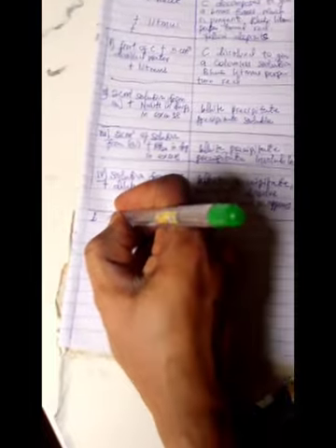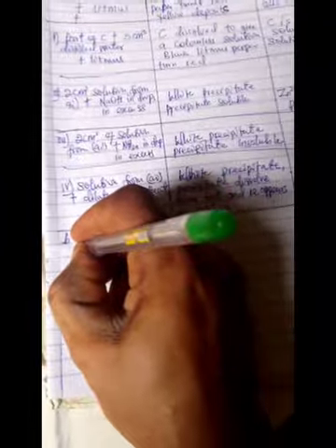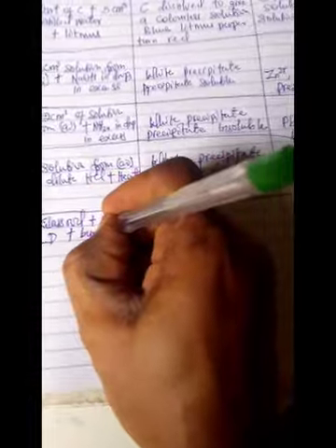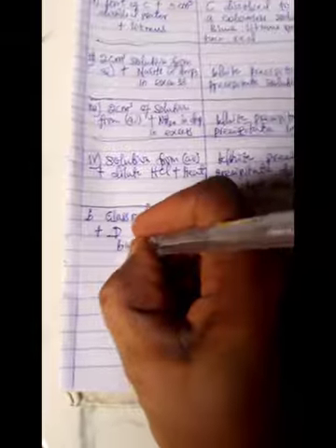Use a glass rod to dip into conc. HCl and collect the sample, and test in a non-luminous flame, which we did earlier. So we say glass rod plus conc. HCl, then plus the sample, plus D. You collect the sample. Then what do you do again? Plus Bunsen burner flame.